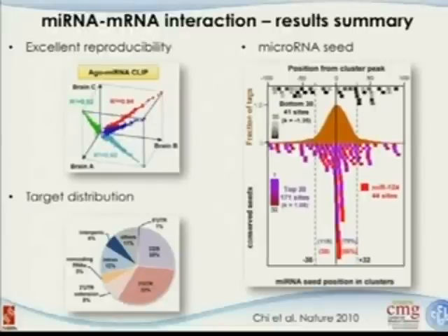They also did a pretty careful bioinformatics analysis to follow this up. Because what you get out of this assay is not a specific target of a certain microRNA. It's all the microRNA targets, and it's a combination of many different microRNAs. So for the region you identified, you know it is a microRNA target, but you don't know which microRNA was targeting that. Okay, so they needed a very deep bioinformatics analysis to further flesh out which microRNA was targeting.